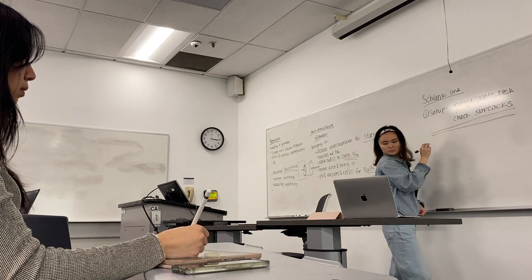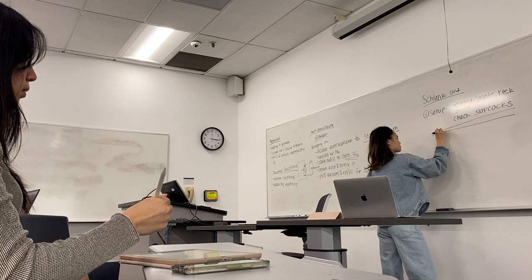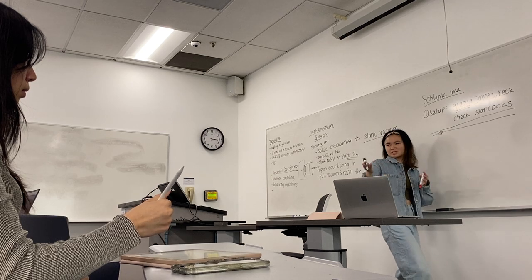So when we're setting up an apparatus, are we also expected to clean off the grease as well? Like disassemble and clean everything as well? Yeah, just set up, disassembly.